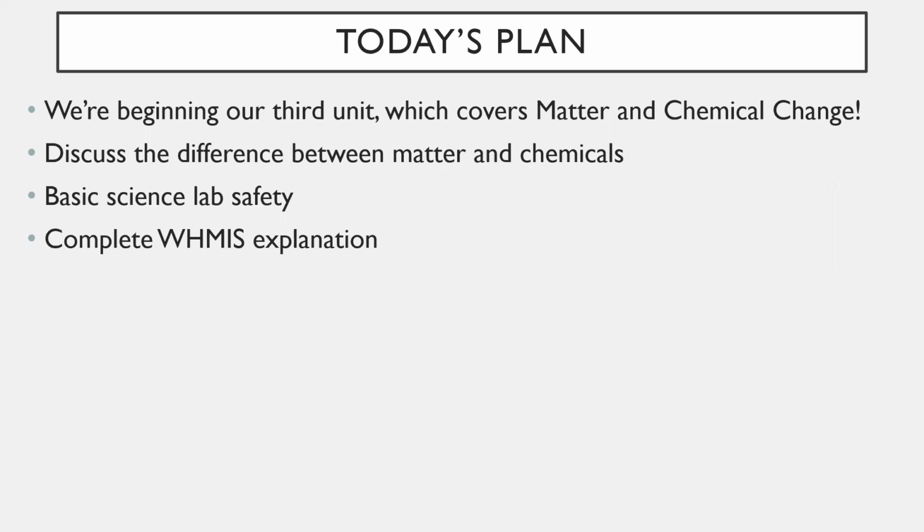We're going to start today by discussing the difference between matter and chemicals. That'll go real quick. But the main focus of today is going to be these two points right here. We're going to talk about basic science lab safety, in other words, the safety tips that you need in order to be safe inside of a lab. And hopefully, of course, once things go back to normal, we will have some science labs that we can do, as well as a complete WHMIS explanation.